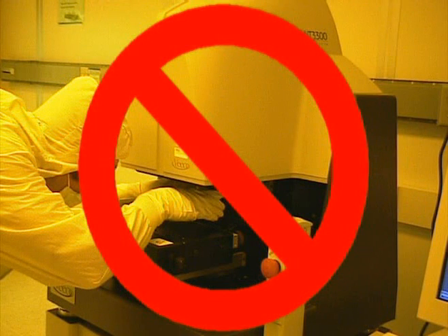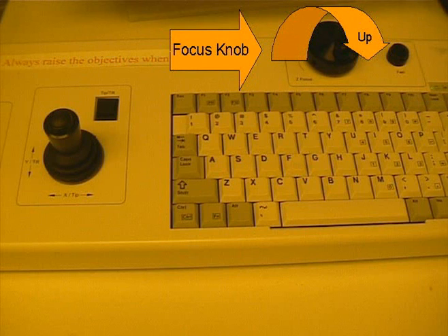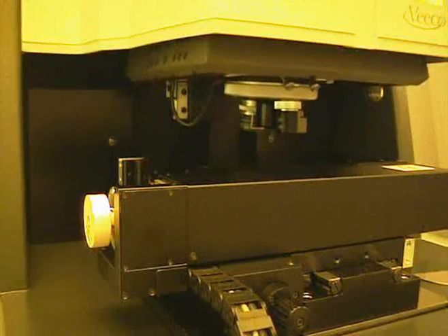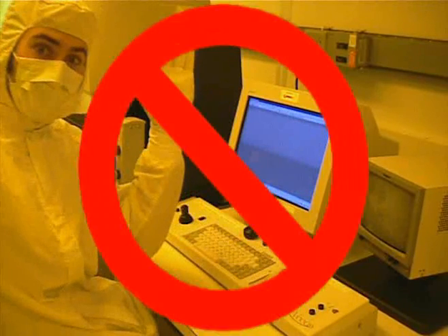You do not ever need to touch the profilometer. Everything can be operated from the keyboard. We can raise or lower the objective lens by rotating the focus knob. Rotating right moves the objective lens up, and rotating left moves the objective lens down. Pressing the fast button can change the speed. Do not crash the objective lens into the sample.